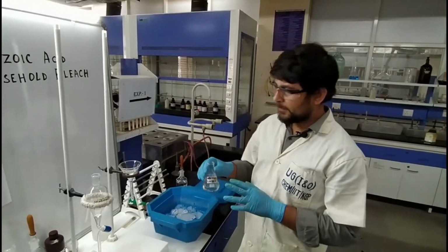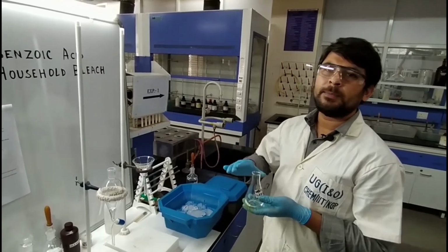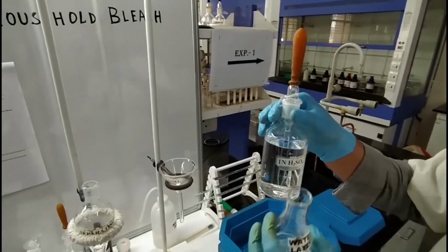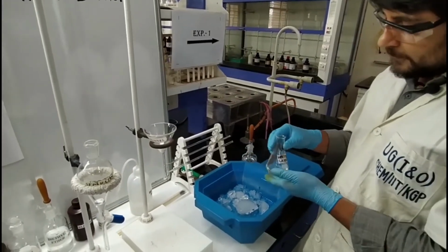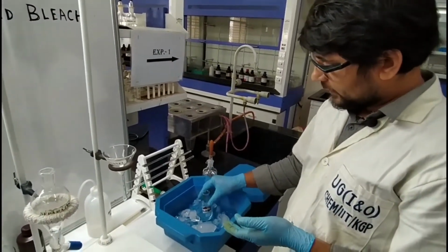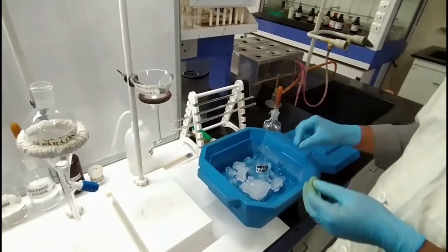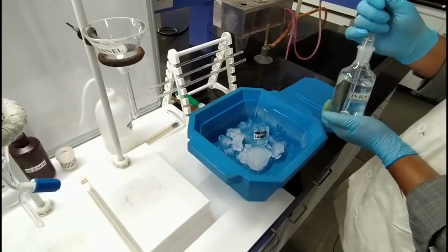So what do we have to do? We have to add some acid to replace the sodium by H plus. I am going to add one normal H2SO4 dropwise into the aqueous layer, and we have to complete this procedure keeping the aqueous layer container inside the ice bath. So now I keep this inside the ice bath. Now I am going to add the one normal H2SO4.